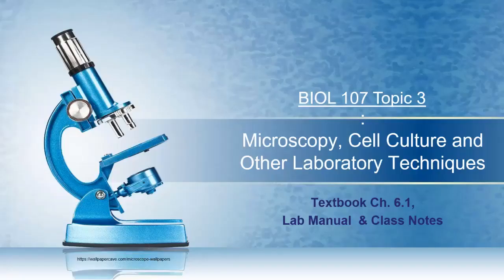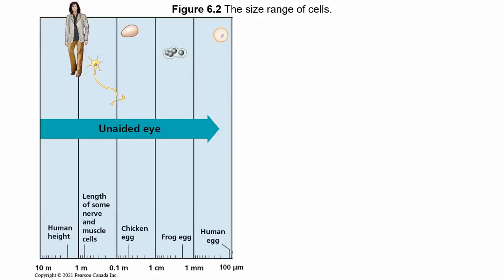All right, so today we are going to talk about mostly microscopy and probably mostly light microscopy. So let's get into that, because this is a really important tool that's used for cell biology and many types of modern biology. And kind of unfortunately the way that these lockdowns have worked, we're missing a lot of our microscope labs, which is really unfortunate. But at least you had some experience for lab 1.